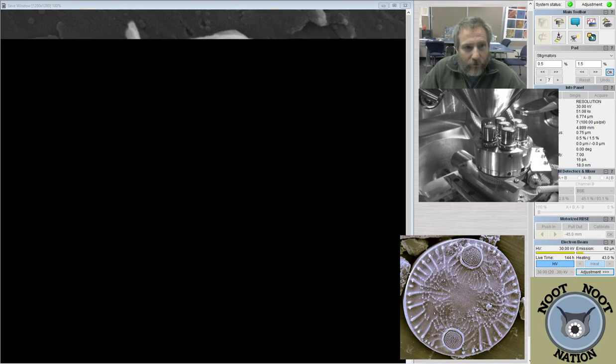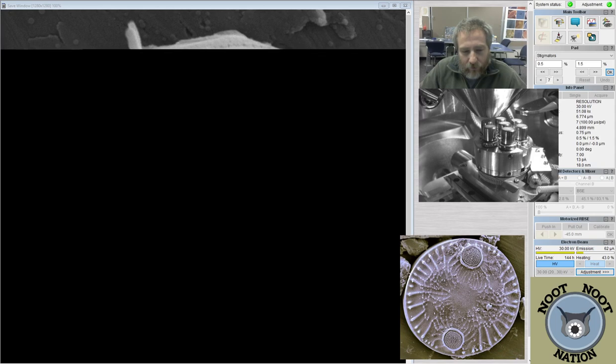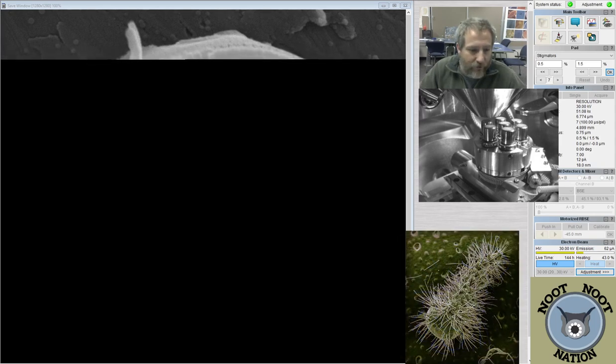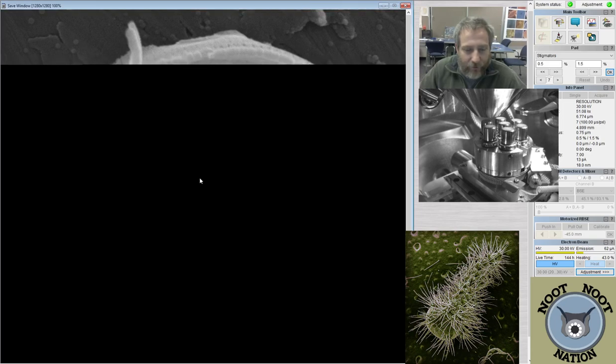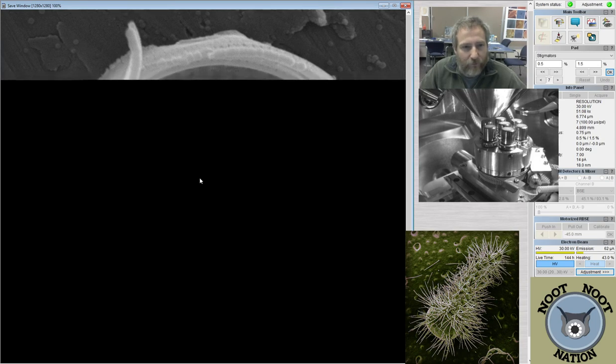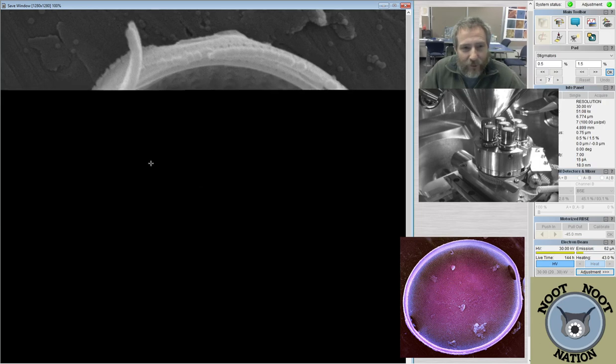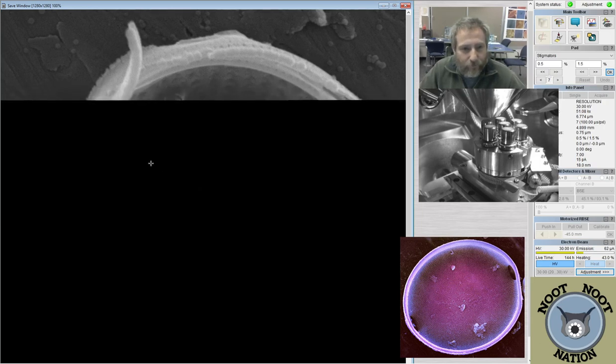And we're still in the early stages of figuring out what's going on with the poster, what's going on with the research from the site. But it's always nice to have a few pretty diatom images that we can stick up on the actual posters so that people, who probably don't know what diatoms are, have a chance to sort of see that.